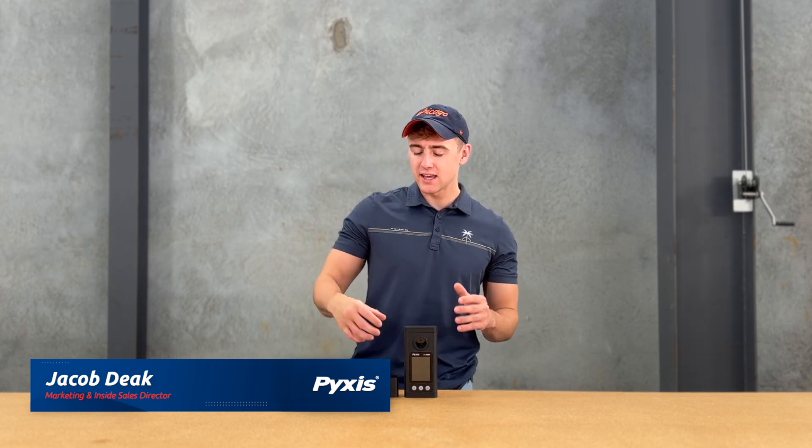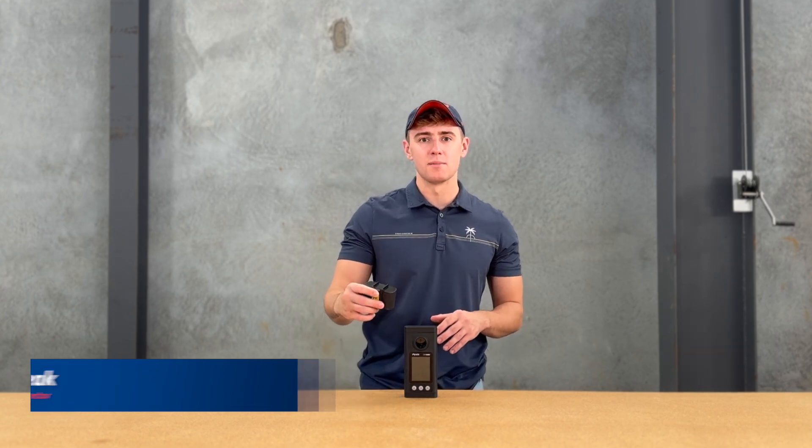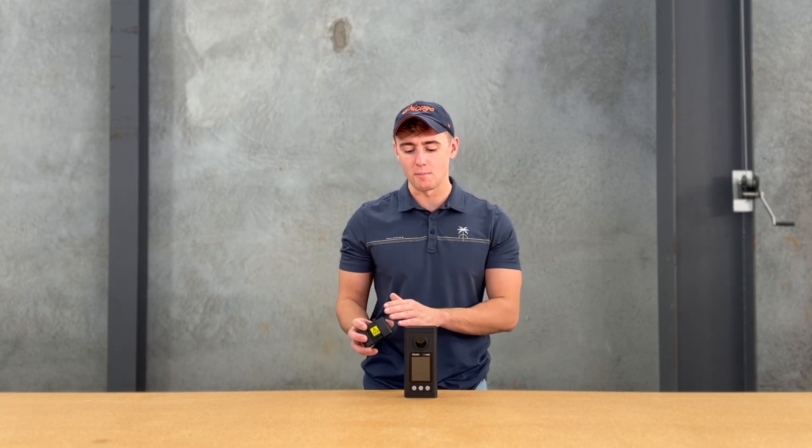Hey everybody, this is Jake DeEck with PixisLab and today I wanted to break down a cool new feature for the OxyGo — being able to add a pH ORP module to the OxyGo and actually read it on screen. So you can do free and total chlorine at low and high ranges, as well as pH and ORP with our module.